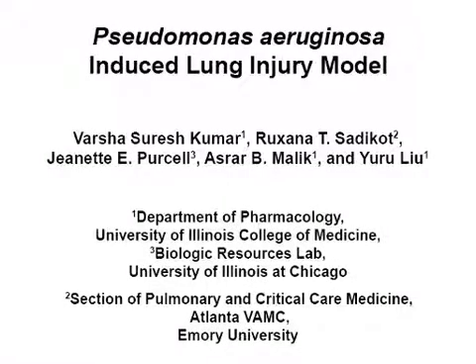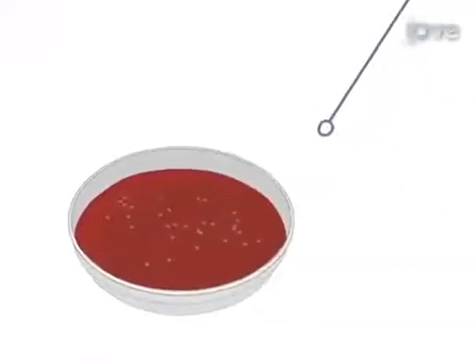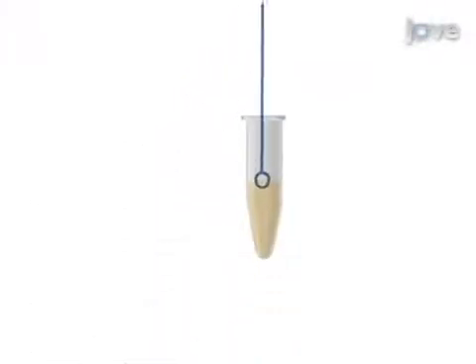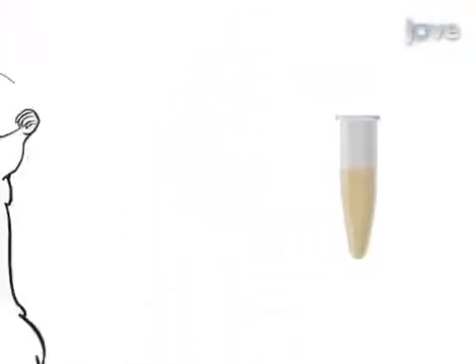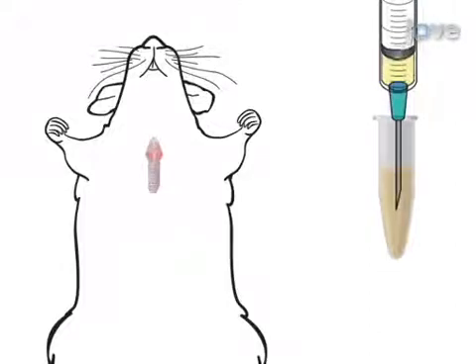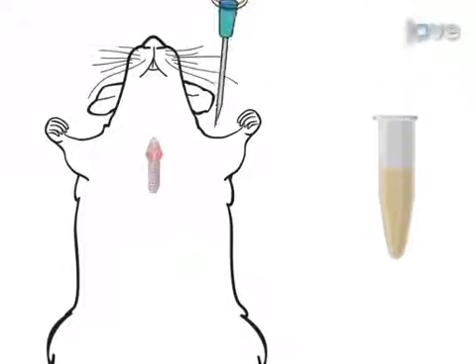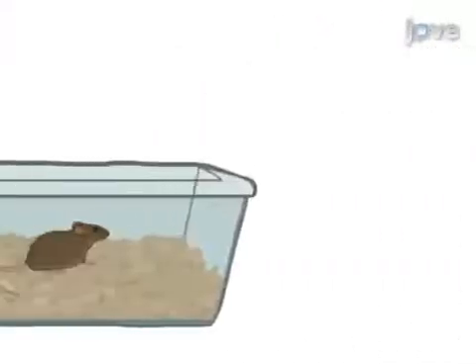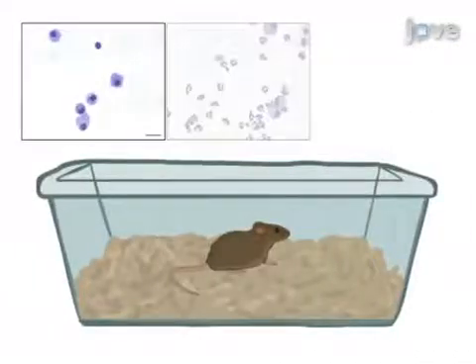The overall goal of this procedure is to mimic pneumonia lung injury conditions in the mouse by Pseudomonas aeruginosa administration. This is accomplished by first preparing Pseudomonas at the appropriate concentration for injection. In the second step, the mouse trachea is carefully exposed and then the bacteria are administered to the lungs by intratracheal injection. In the final step, the disease progression in the mouse is monitored carefully.